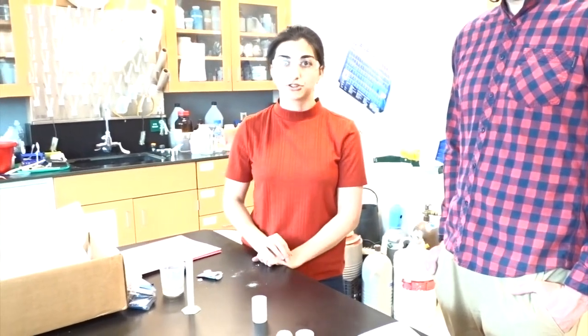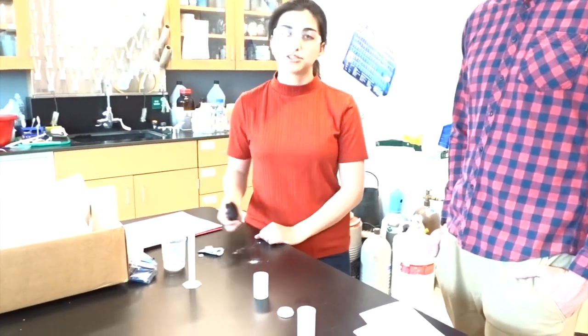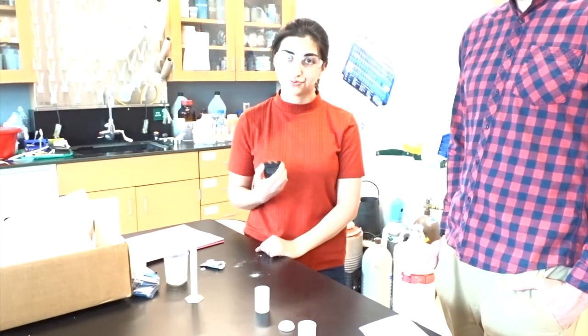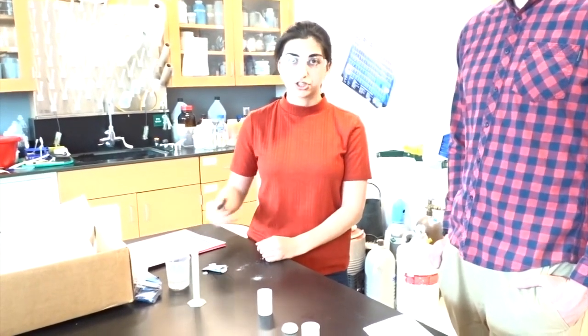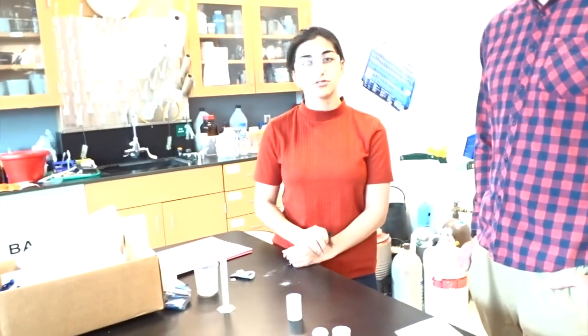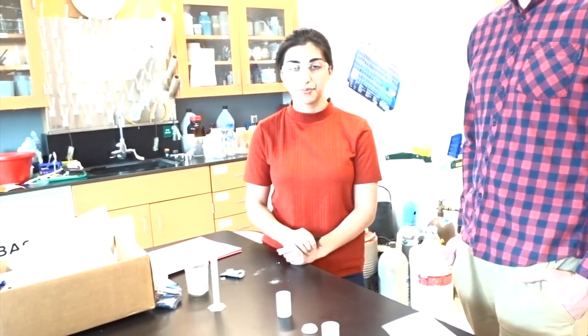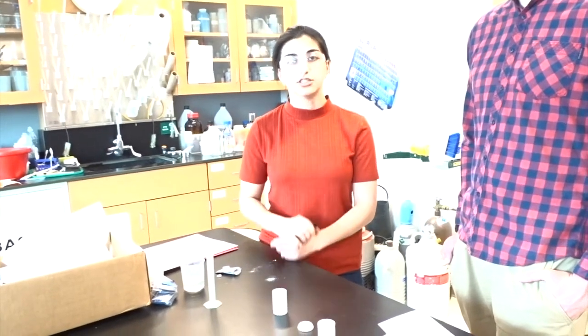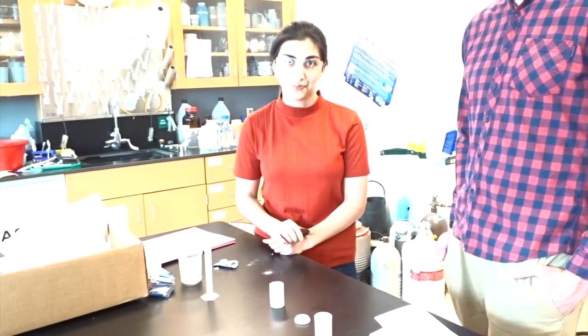And the students will measure how long it takes for the reaction to produce CO2 gas to cause that lid to pop off. The way that they'll measure that is using a stopwatch. Now the kit does not include a stopwatch, which is why we suggest if the students have access to a phone that they could use their phones to measure the reaction rate, or you as the teacher can use a stopwatch on your phone or one that is easily available to you.